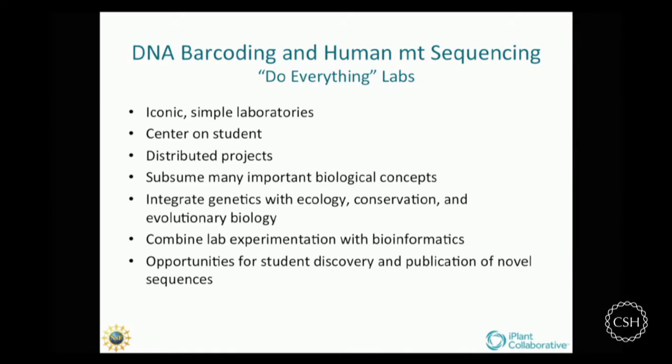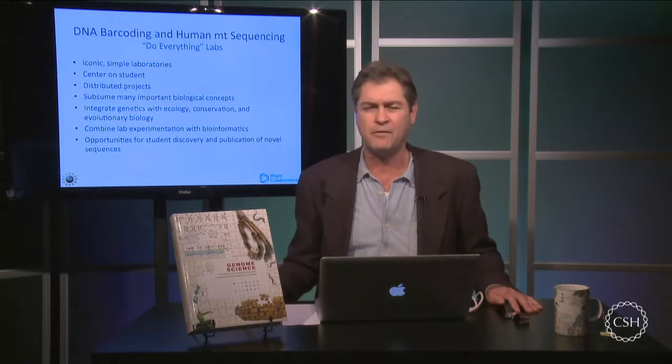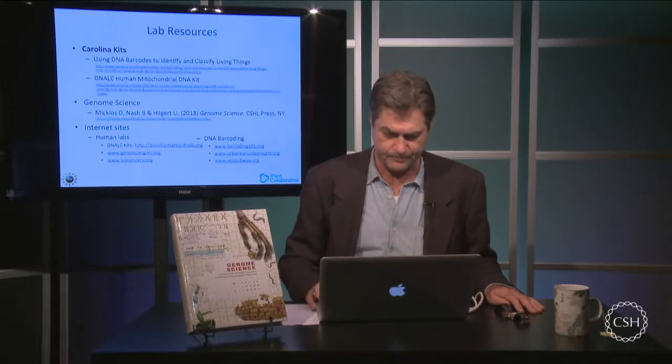It integrates genetics with ecology, conservation biology, and evolutionary biology, something that all of us, I think, strive to do. And importantly, it combines in vitro or wet experimentation in biochemistry with in silico or computer bioinformatics on your computer. And as I'll show you, gives the opportunity for novel, relatively simple but novel publications by students, especially publication of novel sequences to GenBank.